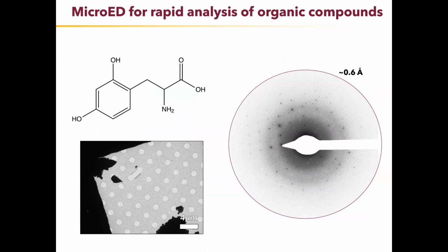So the background of the story, as you see here at the top, is the molecule that a collaborator of mine down the hall was trying to make. And they were trying to make it enzymatically. It's an unnatural amino acid. It looks like tyrosine, but it's got an extra hydroxyl group. They synthesized this. They got results. They ran the NMR, and the NMR was a bit ambiguous. It didn't seem to show the same structure that they thought they made.